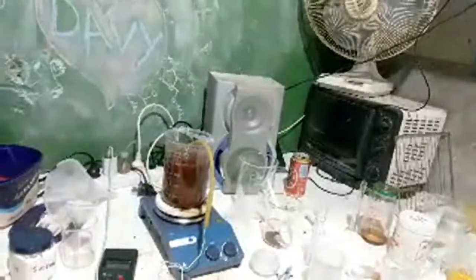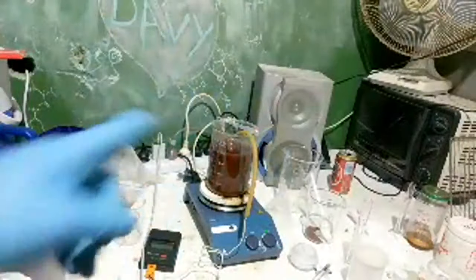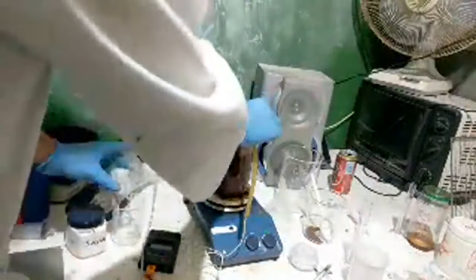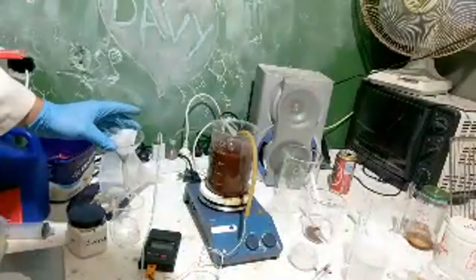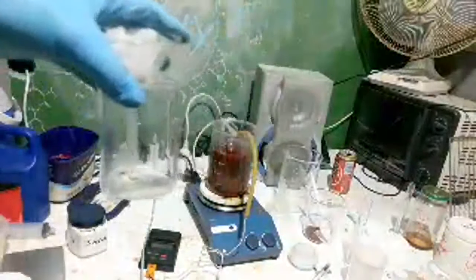What is this? The only possible chance we have here is that we might be able to check our iron solution and see some ferrate, and that would make my day. Nothing. There's some lovely crystals in there, but I think they're just possibly potassium chloride. It's not going to focus on it, is it?